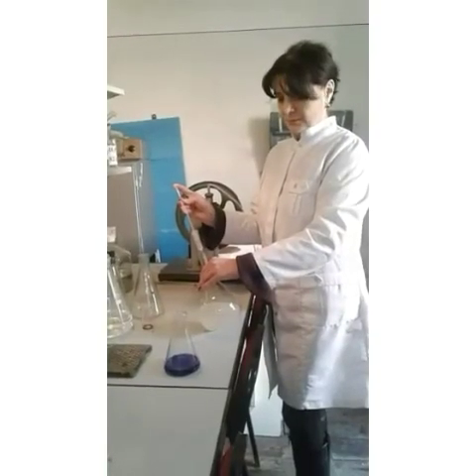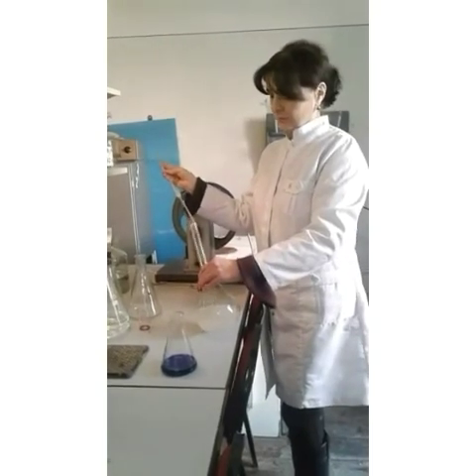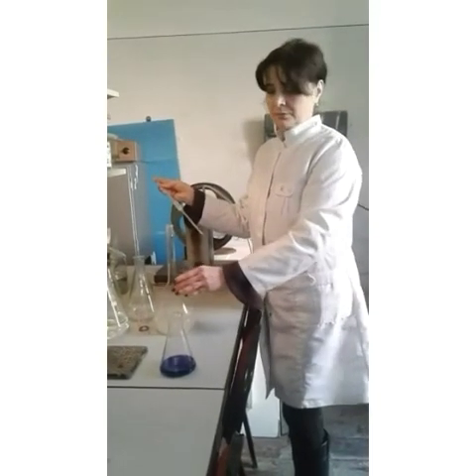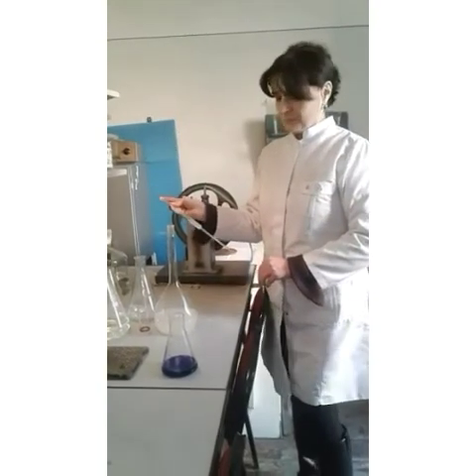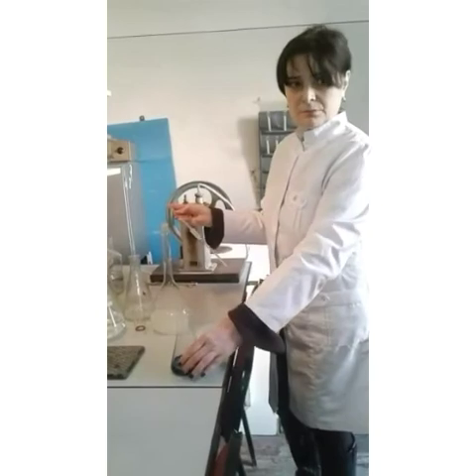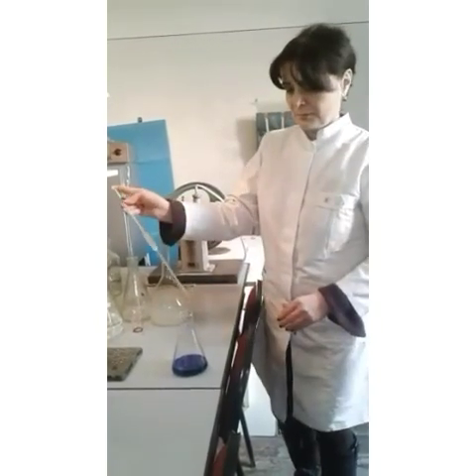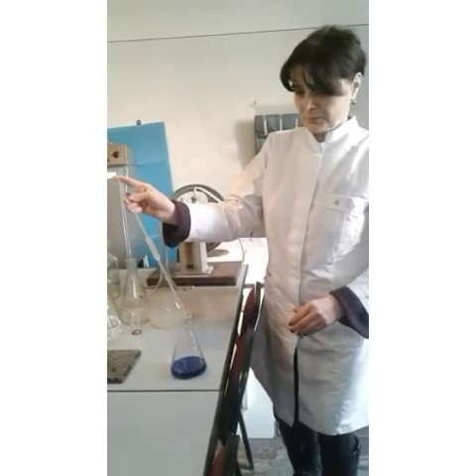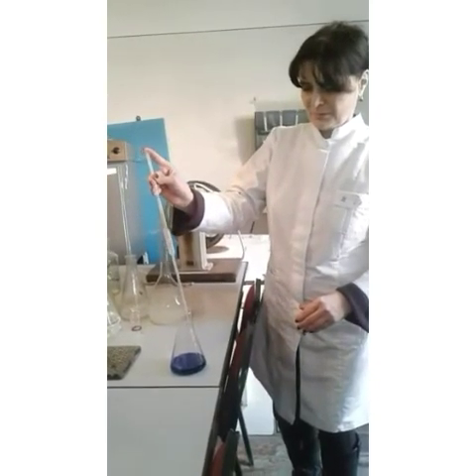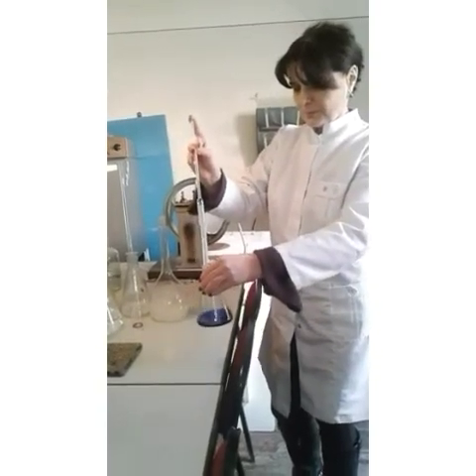We measure 20 milliliters of solutions Fehling 1 and Fehling 2 each, and pour both solutions into a conical flask with a capacity of 250 milliliters. In this flask, we add 20 milliliters of filtrate. At the time of mixing the solutions and filtrate, such reactions occur.